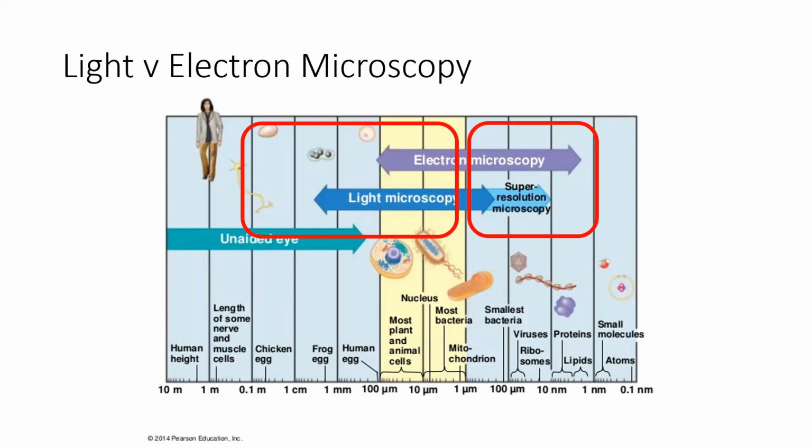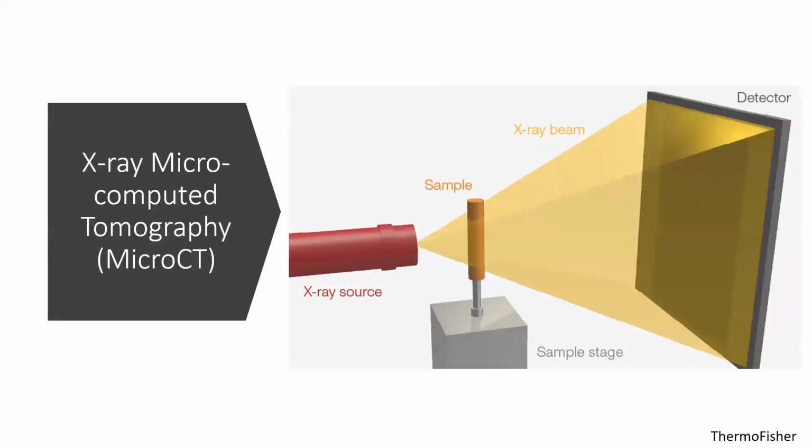microCT is a really nice method to combine with electron microscopy. And I'm going to show you the compatibility of the two, but this covers, pretty soon we're not going to need light microscopy at all. Kidding, it's still useful. X-ray microCT is like shadow puppets.